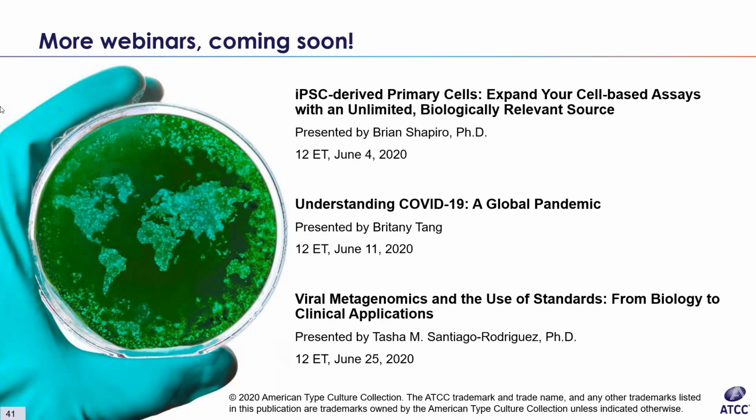Steve, we just got an update. He means specifically aliquots of cells. So how long can you leave your frozen down cells in -70 before moving them to -140? Okay, sure. Sorry. Yeah, I previously answered that.